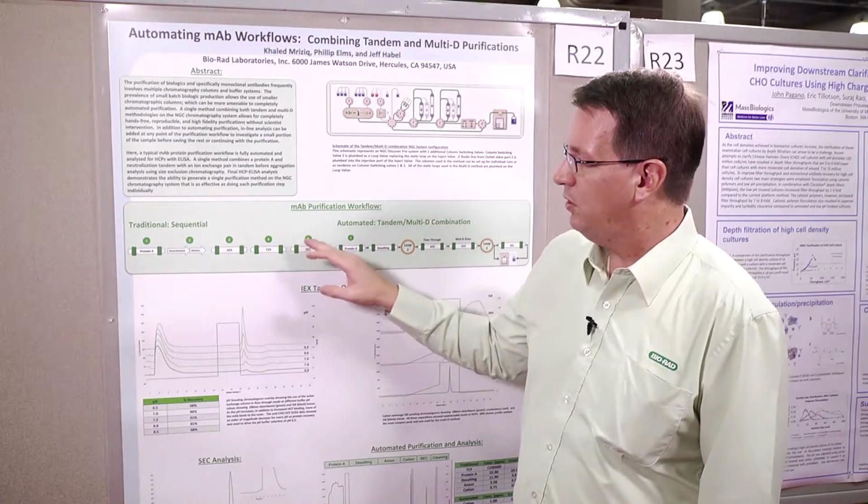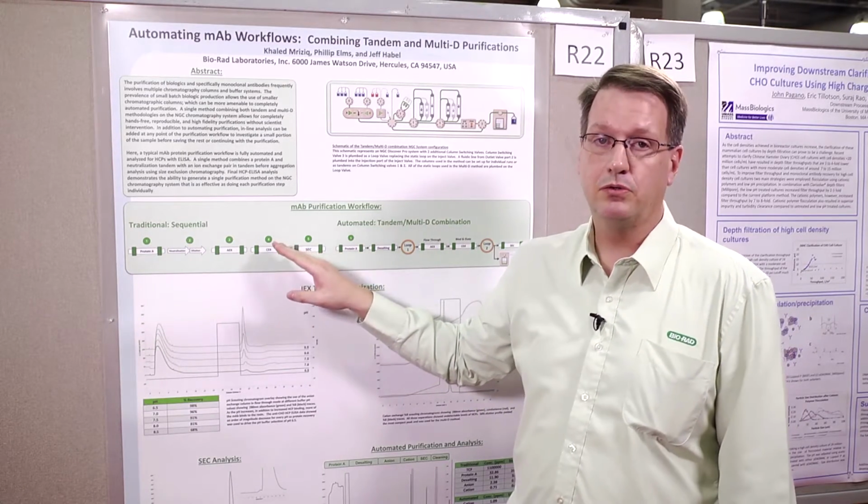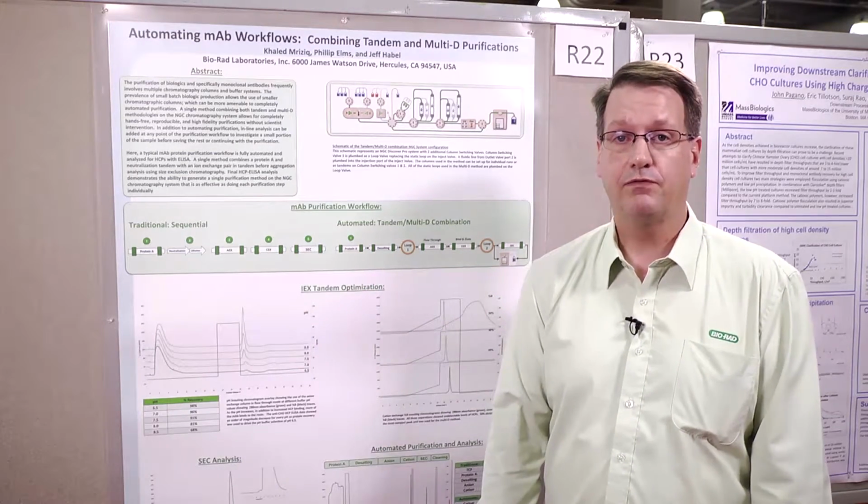The interesting part about this whole process is that to generate this single automated method, you're actually using all the information that you gain from the optimization of your traditional purification. So it's really no additional work for the scientist involved.